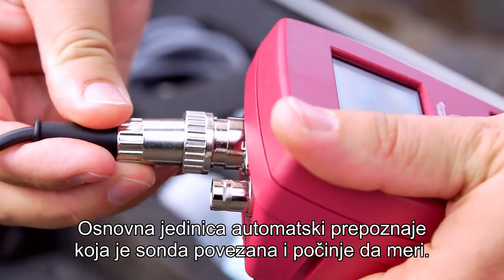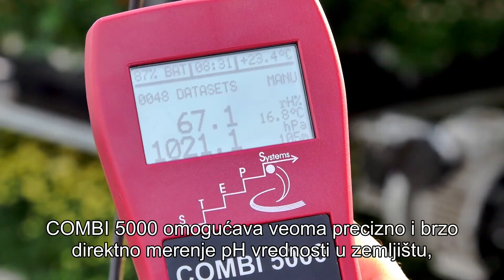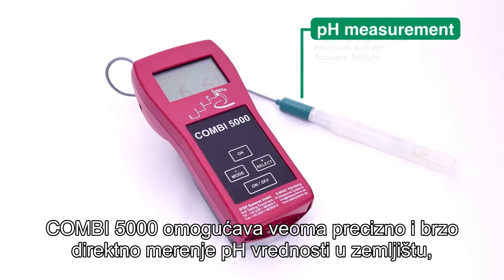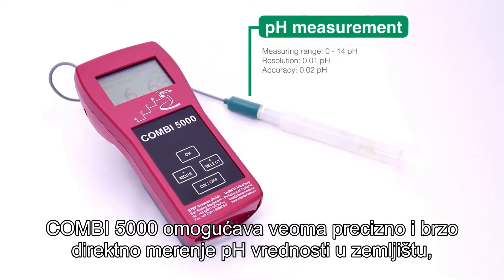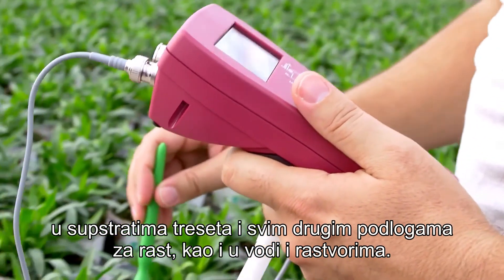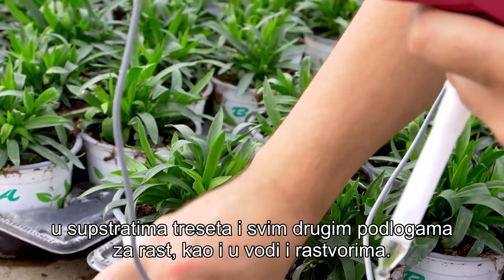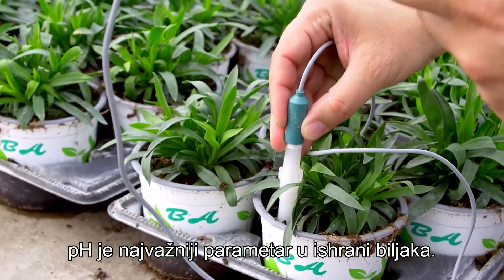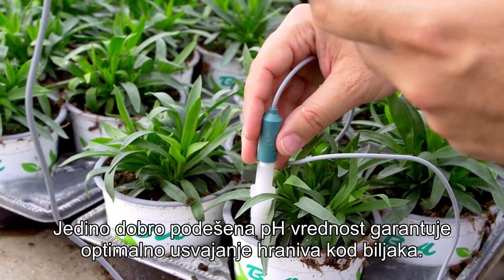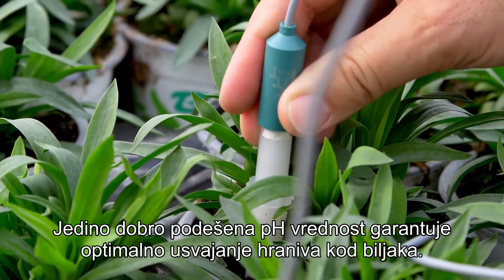The basic unit automatically recognizes which probe is connected and starts measuring. The COMBI 5000 allows for a very precise and fast direct measurement of pH in the soil, in peat substrates, and all other growing media, as well as in water and solutions. pH is the most important parameter in plant nutrition — only a well-adjusted pH value guarantees an optimal uptake of nutrients for the plants.